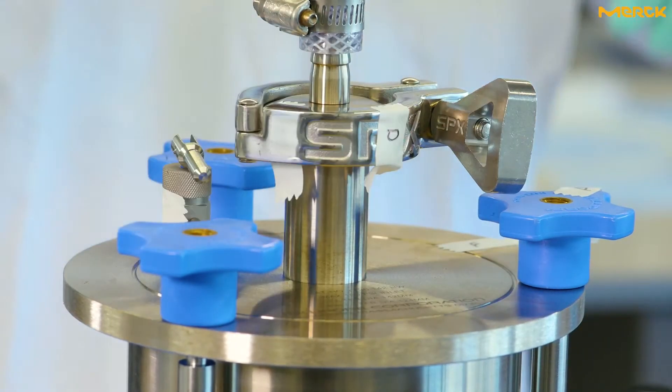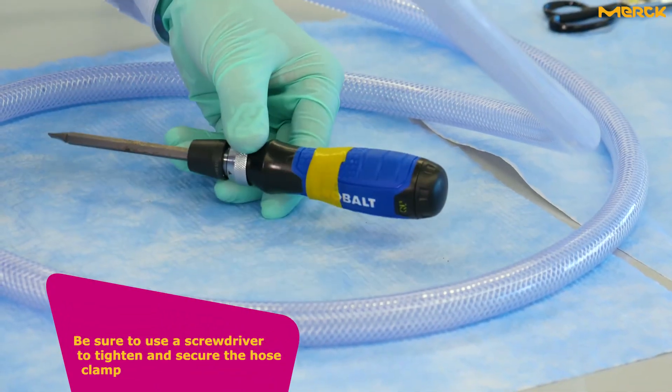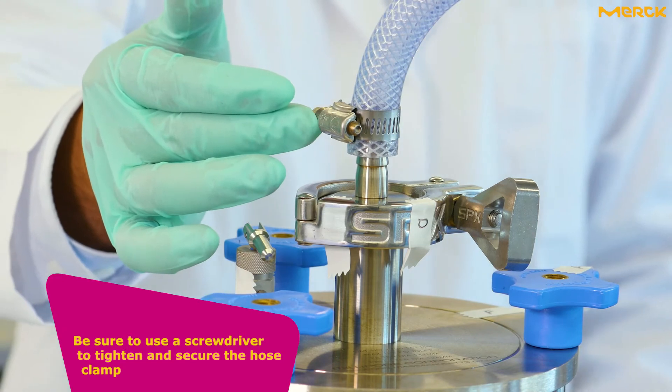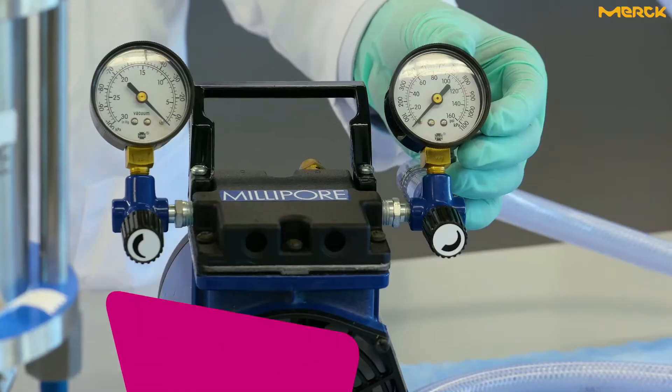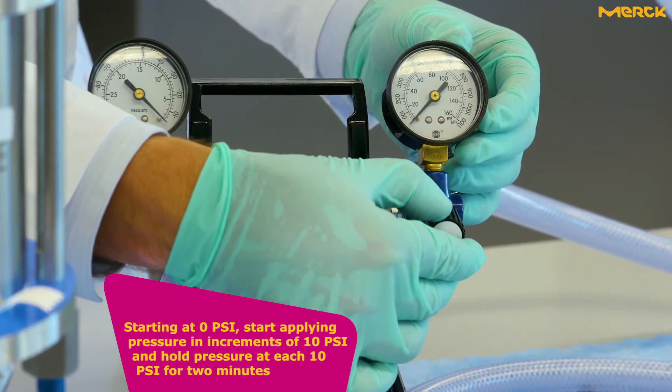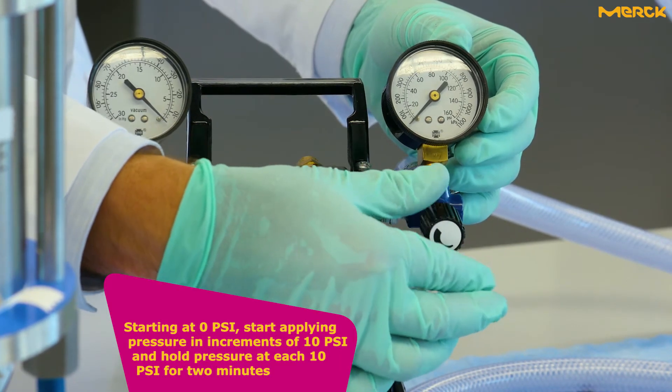Be sure to use a screwdriver to tighten and secure the hose clamp. Starting at 0 psi, start applying pressure in increments of 10 psi and hold pressure at each 10 psi increment for 2 minutes.